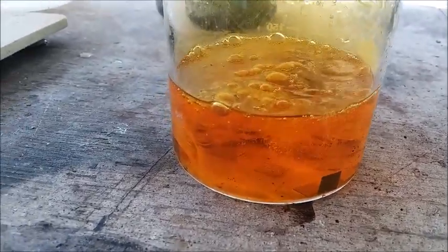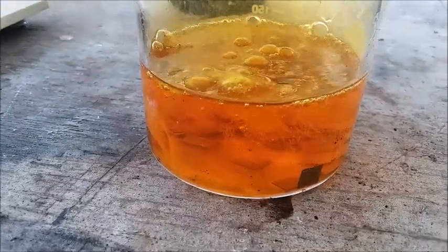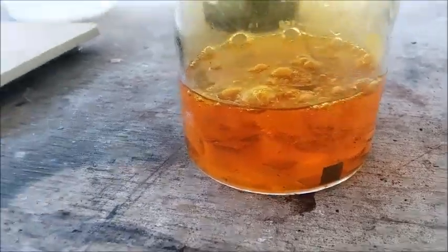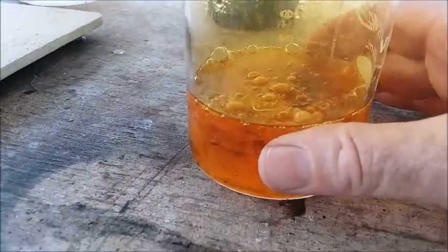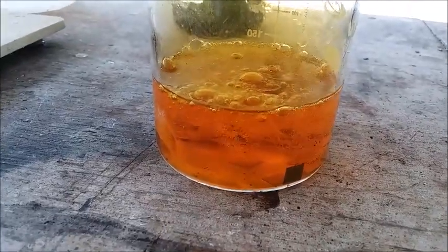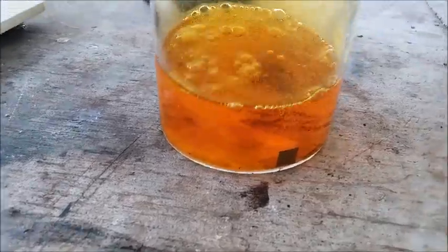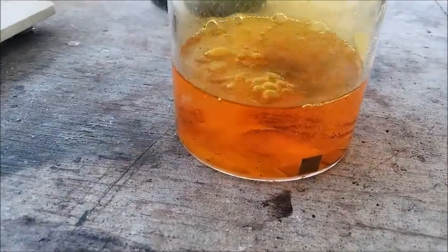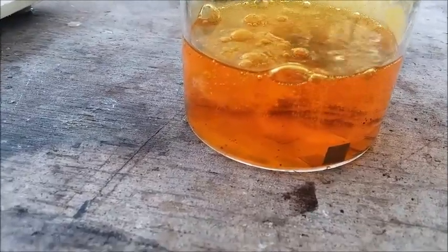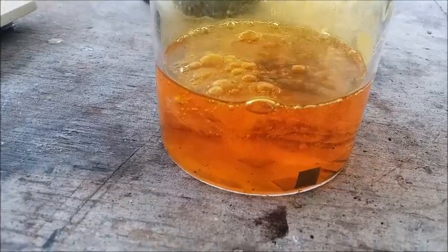This has been off the heat now. I just warmed it up on the hot plate, then took it off once the reaction started getting really vigorous. And it's been off the hot plate for a long time now. And this is barely warm, but look how vigorous that reaction is. Gold is going into solution. Look at the color of the solution. That's pretty dark. There's a fair amount of gold in there. So we'll just let this go to completion.